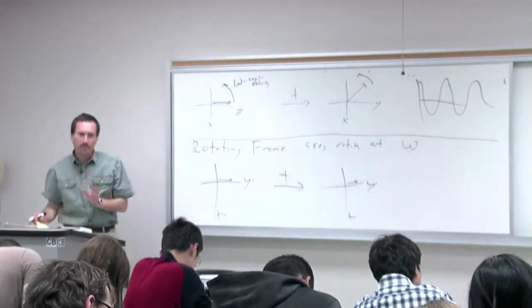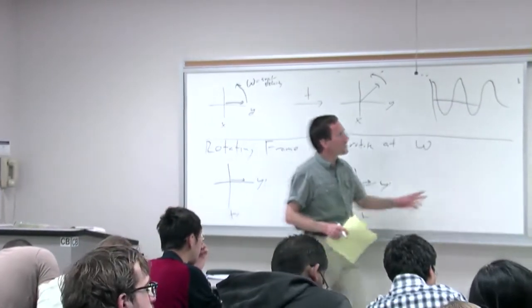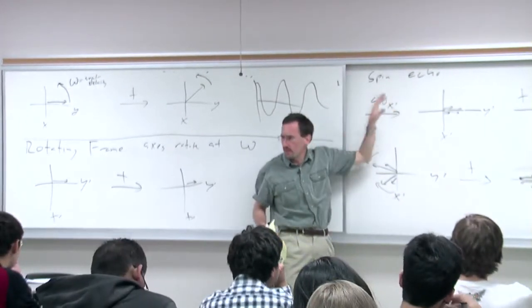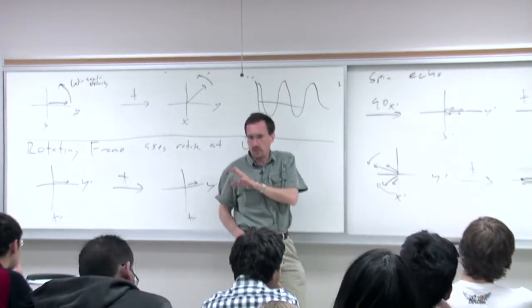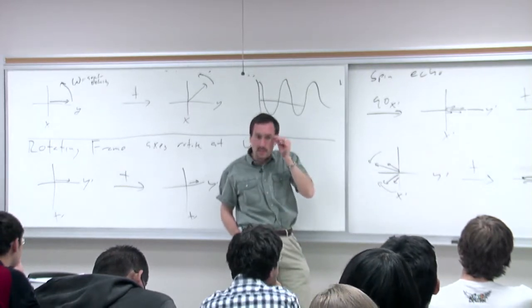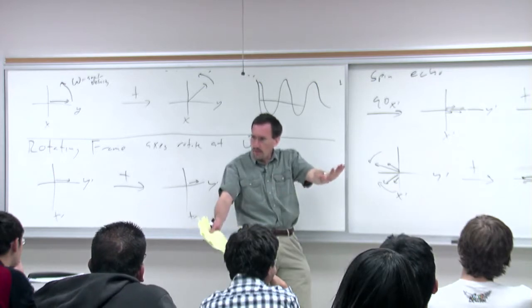And this is the basis for many, many sorts of NMR experiments. This is called a spin echo. One of the reasons that people invariably do spin echoes is, in addition to what we're talking about here, which I'll show you in a second, which is J modulation, you've also got T2 relaxation, where vectors fan out in the xy plane.